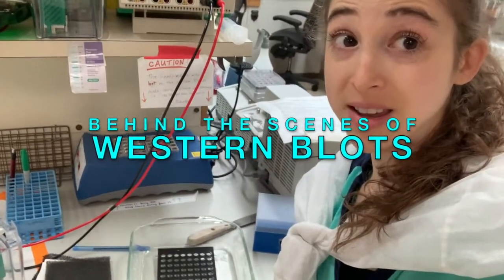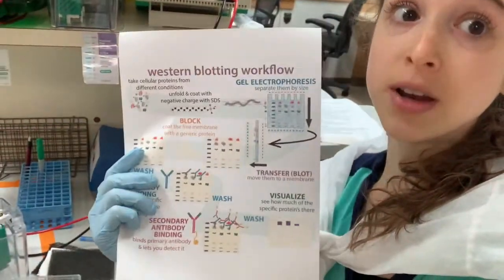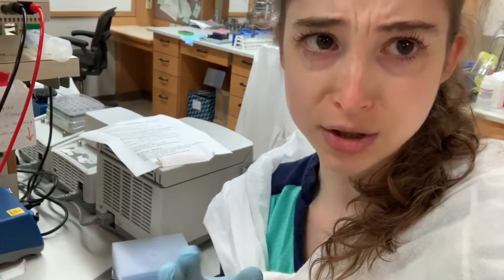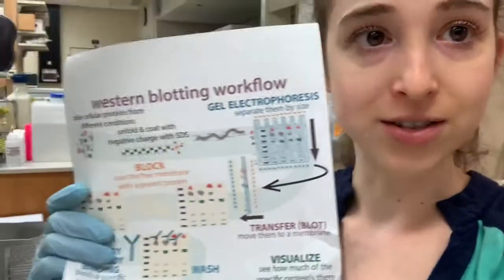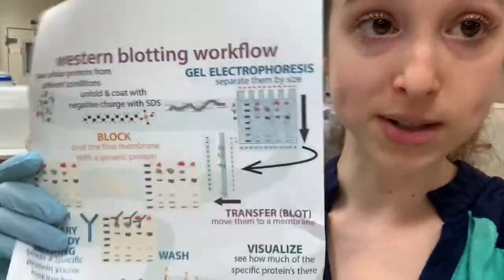If you've been in a biochemistry lab, you might be all too familiar with this thing. We're talking Western blotting. Western blotting is a technique that we can use to look for specific proteins after we do an SDS page gel. Today is a more casual introduction to Western blotting — what does it actually look like and how do we set things up.